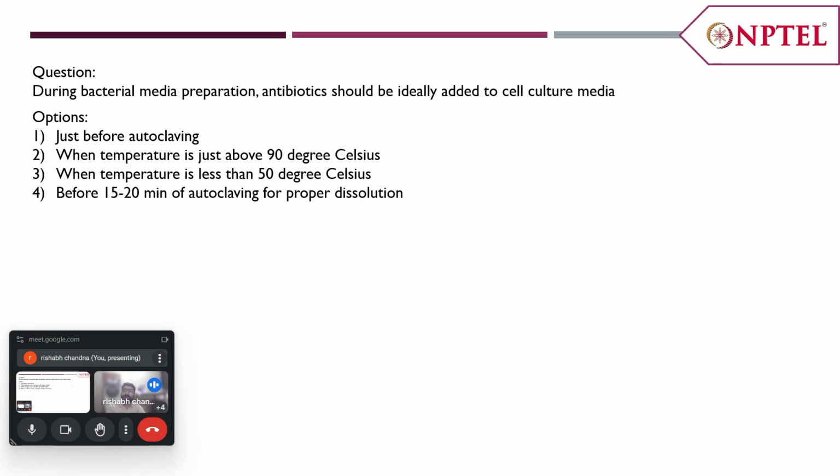During bacterial media preparation, antibiotics should ideally be added to the cell culture media. What can be the correct option?